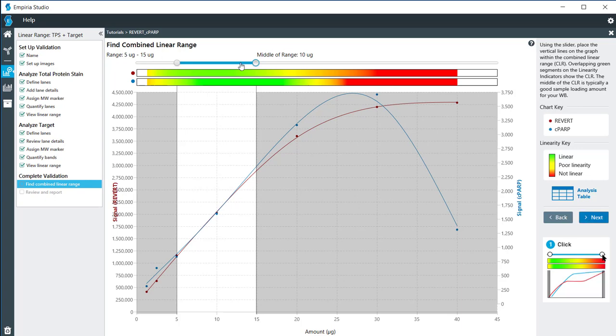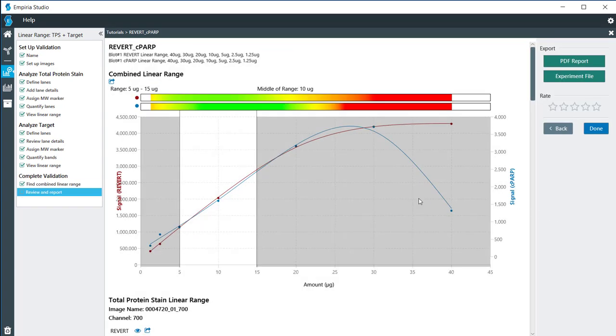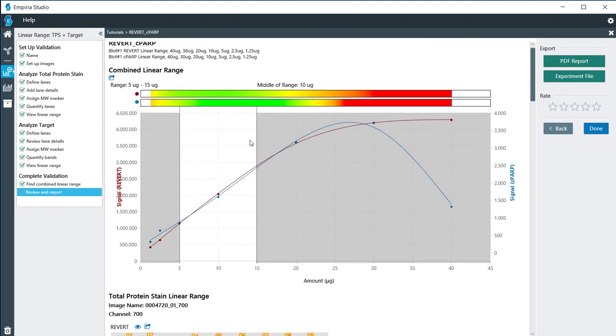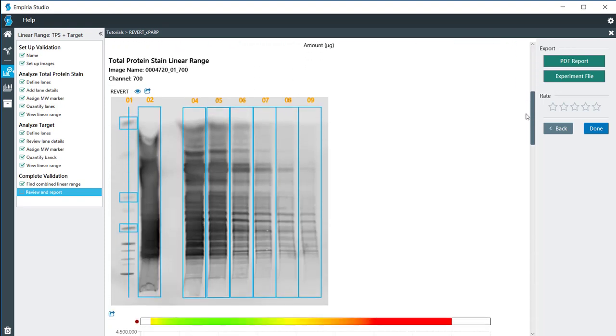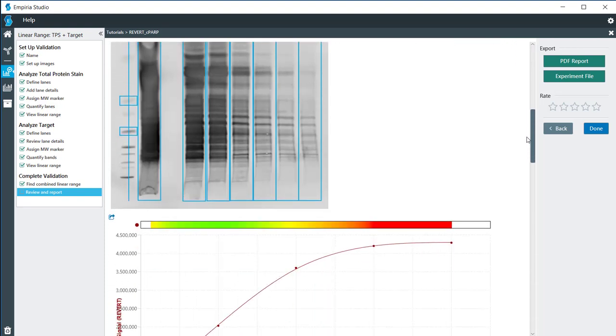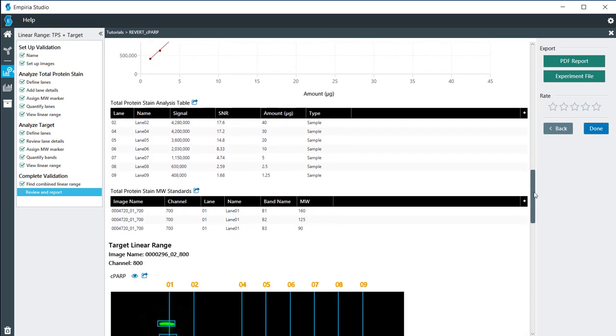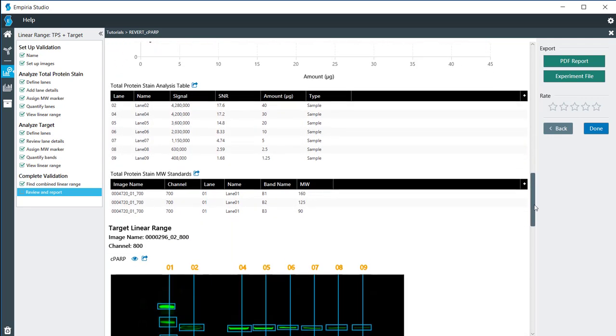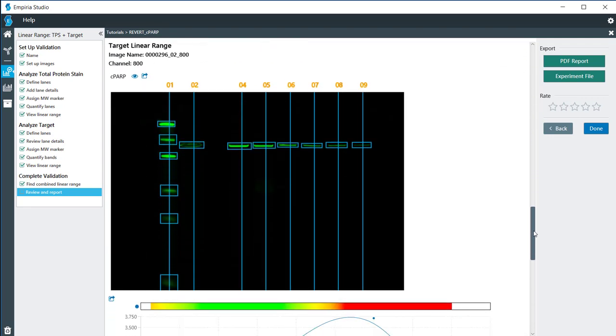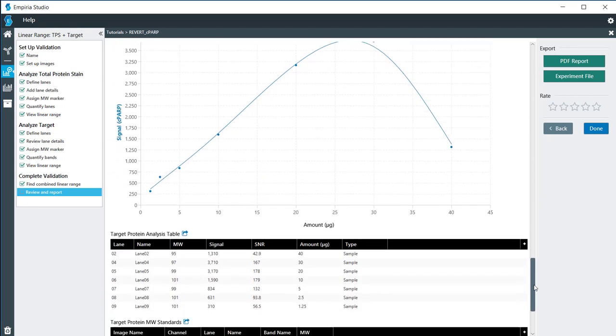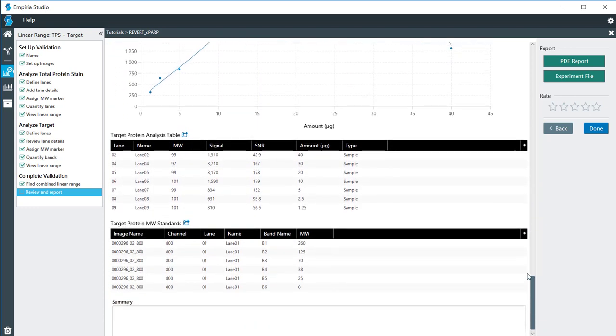Once we have determined that, I'm going to click on next. Here in the report we can look at the combined linear range for both the revert and the targets. We also have images from the revert along with its single graph along with the data tables, and then we have the image from the targets and its graph and the data tables. If you want to export this to another computer for someone else to look at, you can export this as an experimental file. Or if you want to do a PDF report so that you can print it off, you can do that PDF report right there.